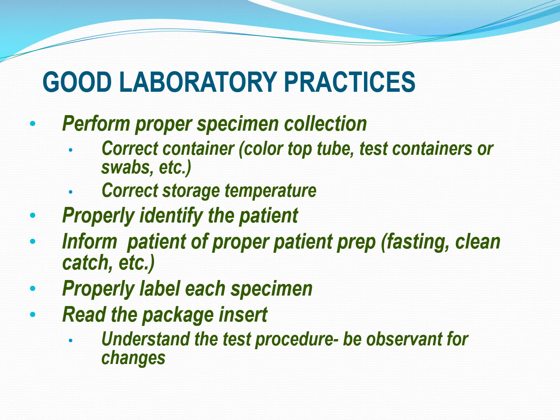You want to inform your patient of the proper patient prep. Were they supposed to be fasting? Is this a clean catch urine that they need to collect? You need to talk to your patient and inform them of what they need to do, either before you collect this specimen, or if you're sending them home and they're coming back at a later date and they need to be fasting, you need to make sure they understand that. Once you have collected your specimen, and you never label it prior to collection, then you properly label each one of your specimens.